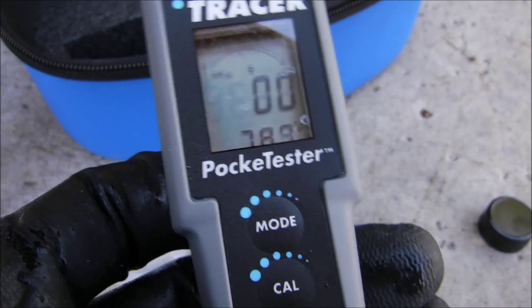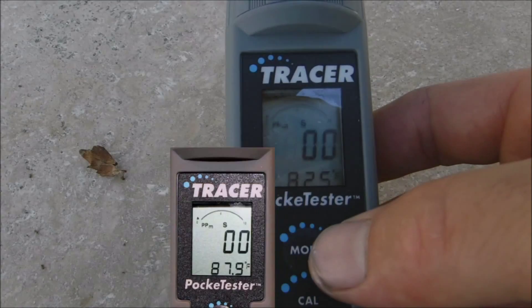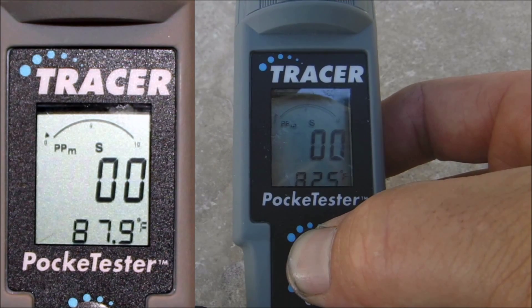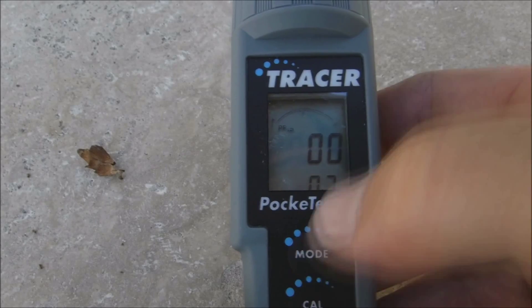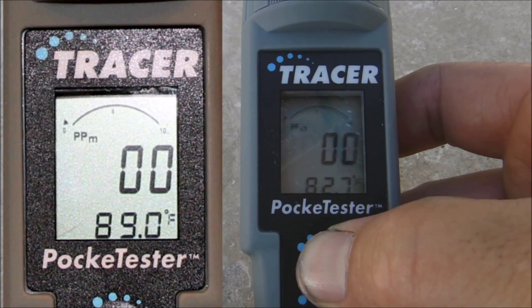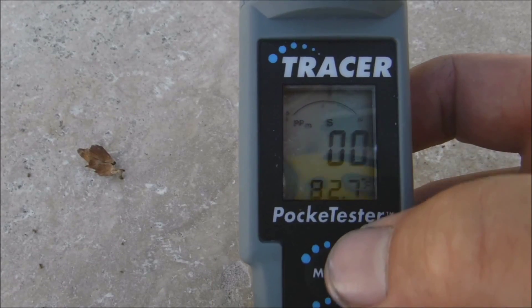So now the unit is ready for use. To switch modes, you just hit the mode button and hold it down for two seconds — it'll switch modes. Now that's in conductivity mode. Now it's in total dissolved solids mode. Back to salinity here with the S on the screen.